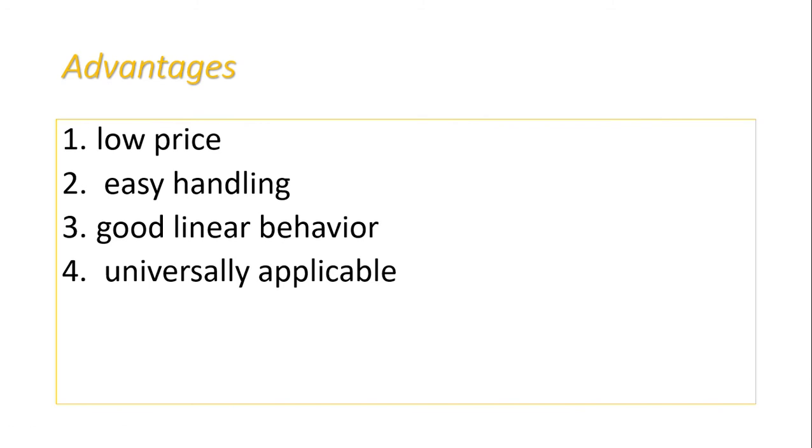Advantages for RI are low price and easy handling, good linear behavior, and it is universally applicable. It's low priced compared to other detectors, and it's universal as I said before.